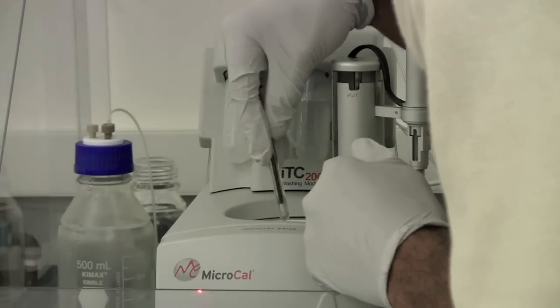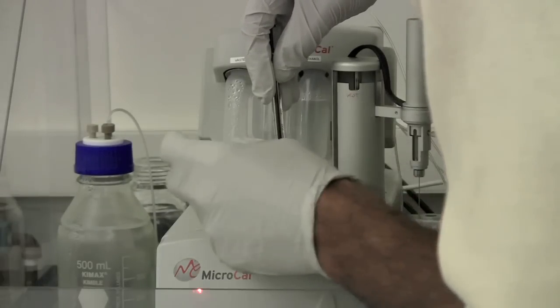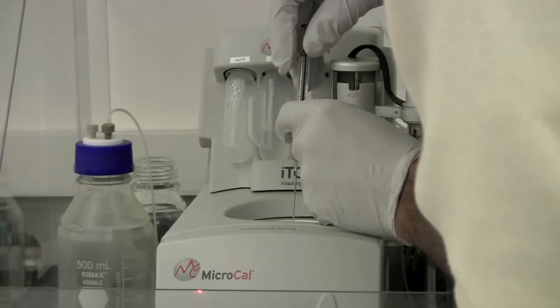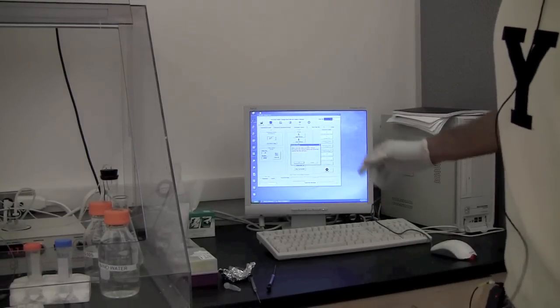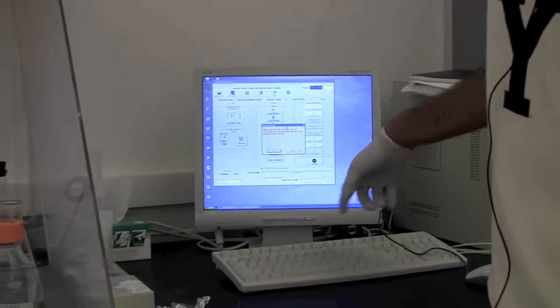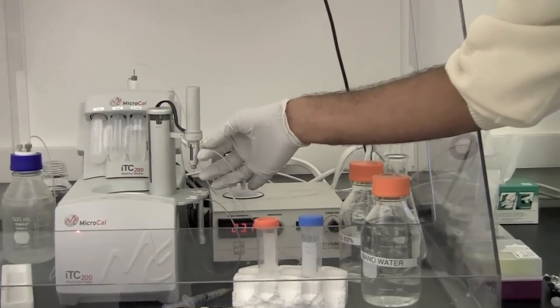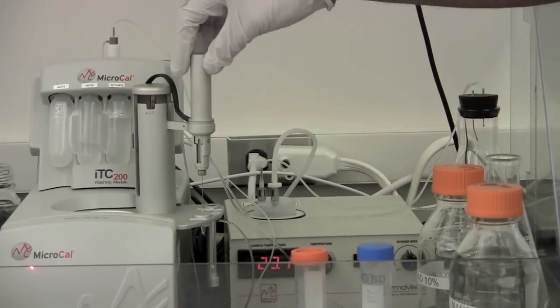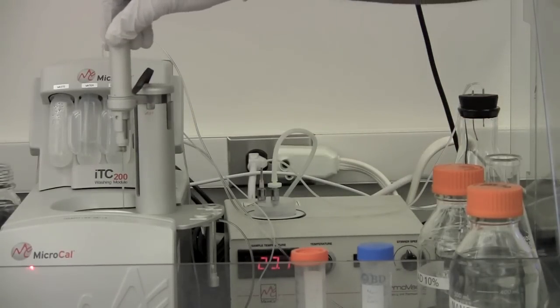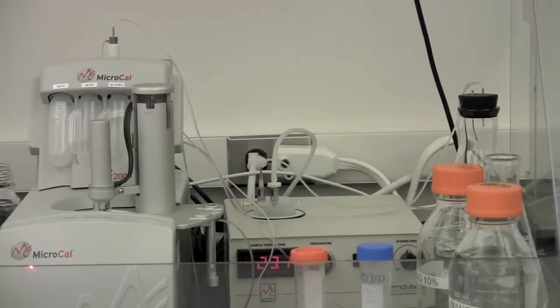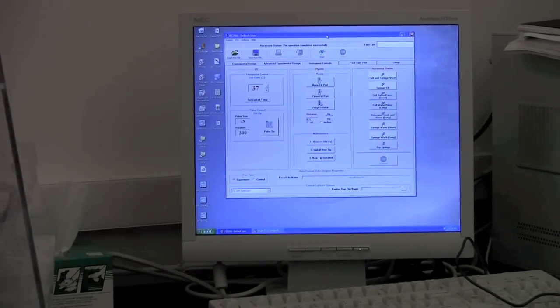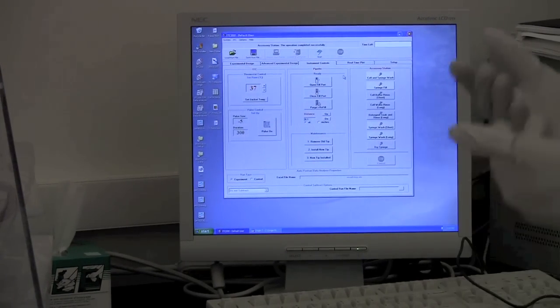After that, suck the extra solution from the cell. Once you get the message that the syringe is dry, unhook the syringe from the tubing gently. Take out the syringe and put it inside the cell. Then click OK on the screen for this message — this completes the process of washing and filling the syringe and cell.